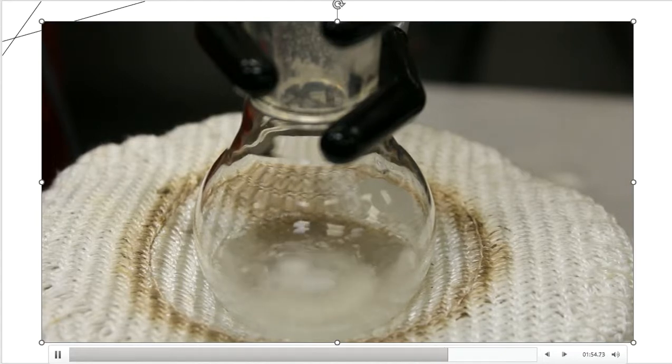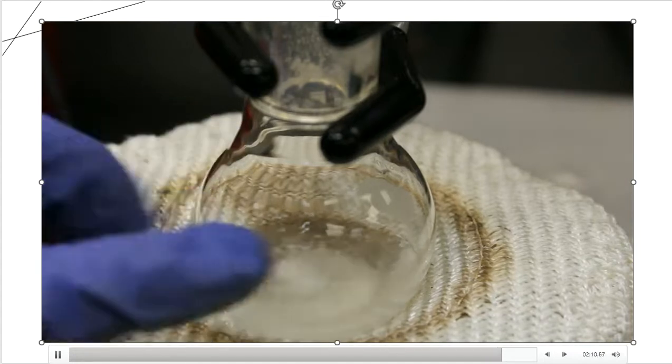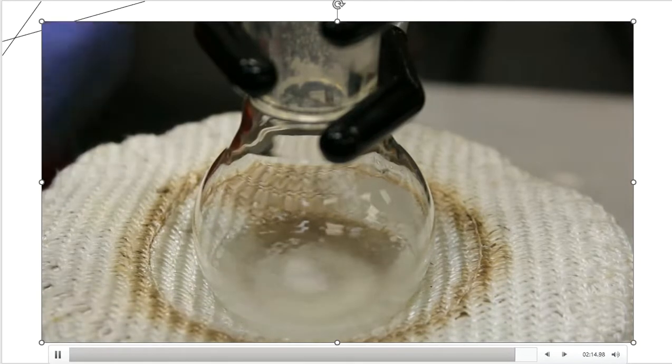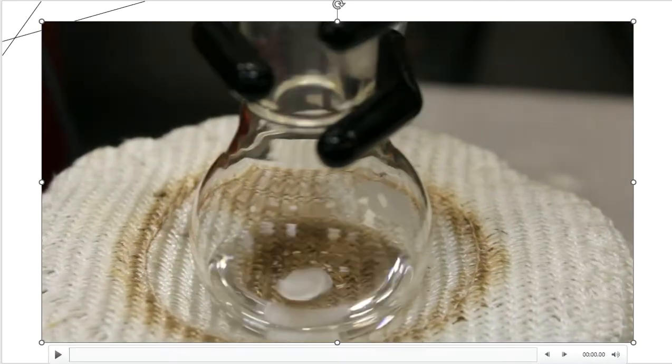However, I'm going to go slow enough with it where hopefully I won't have to use that. It's not needed. It's unnecessary. It's an extra step that I've got to drag out. So with a little bit of patience, I'll be able to completely ignore that part if I'm lucky. All right, so I'm going to continue to add the aluminum chloride down into this boiling flask. Nothing too much is going to change, and then we'll pick back up after that addition takes place.